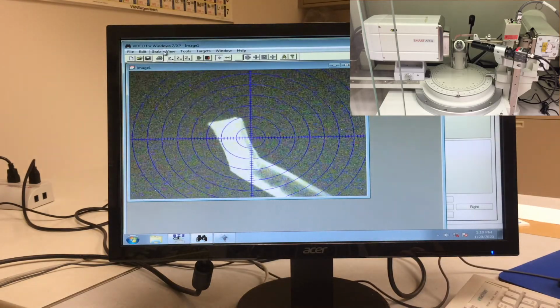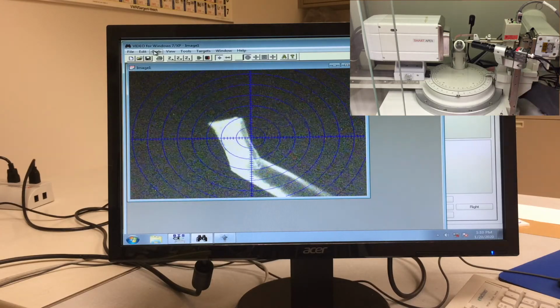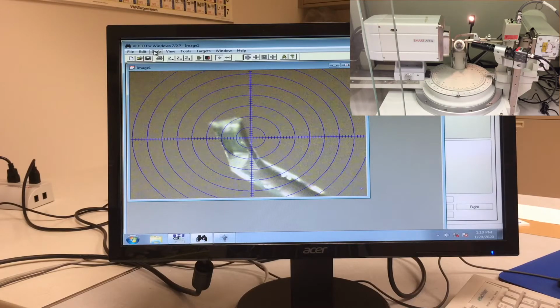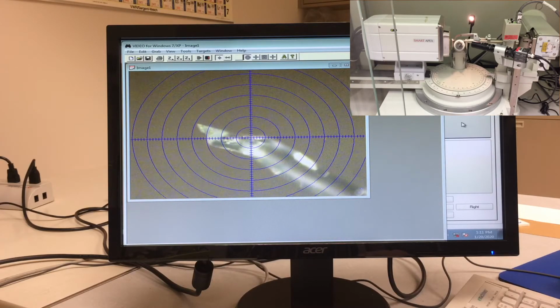So first I'm going to center the crystal, and it's just like doing the spindle stage, except we don't have to worry about the axis of rotation. We just have to rely on the axis of rotation being correct, or being fixed to the center, which may not be the case, but I've dealt with this before and it works. So I'm just making sure that that window stays on top. You have to click it twice sometimes to make it work.